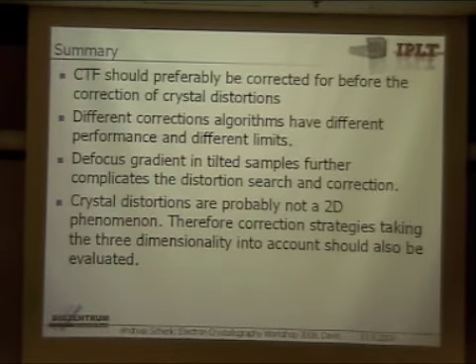And the fourth thing is, crystal distortions are probably not only a 2D phenomenon. Therefore, we should also start exploring strategies to account for the third dimension, like with a maximum likelihood approach, and maybe determine distortion mixtures in 3D or something like that.